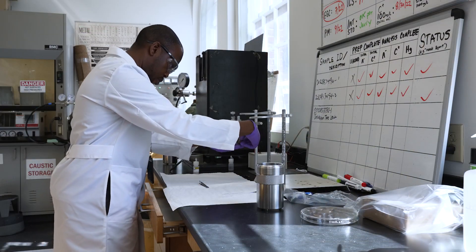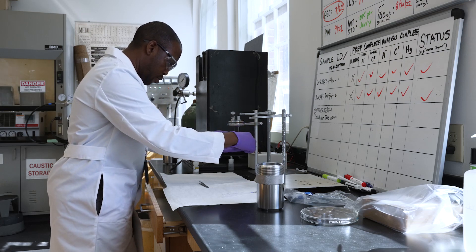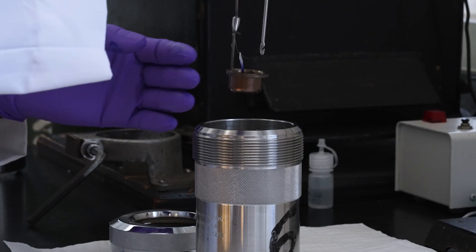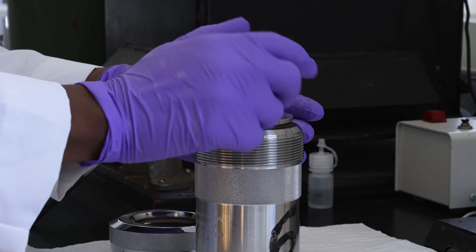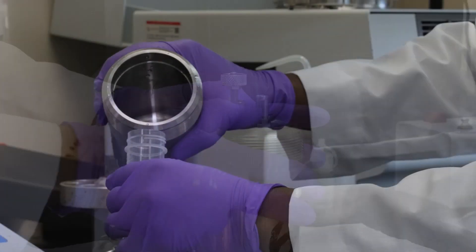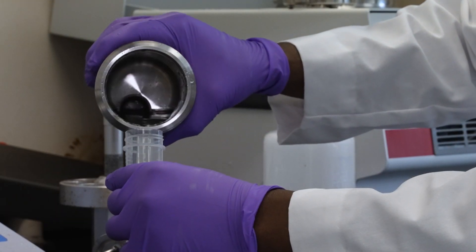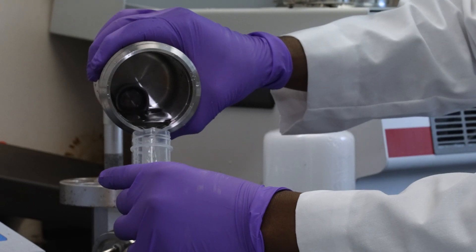Other products require a total analysis, where the sample is completely mineralized through combustion or heated acid digestion. The resulting ash or residue is then dissolved in water or acid and that liquid is tested.